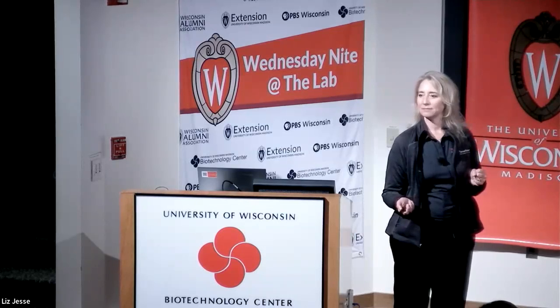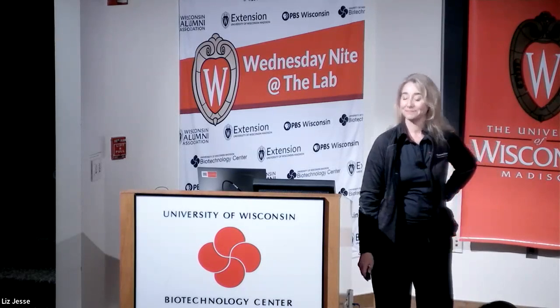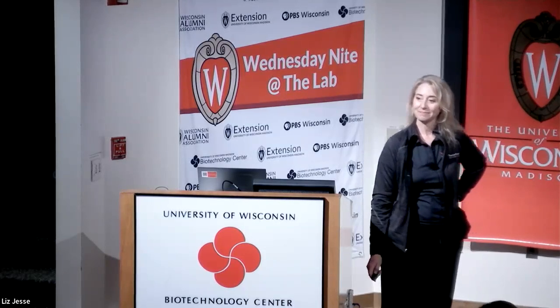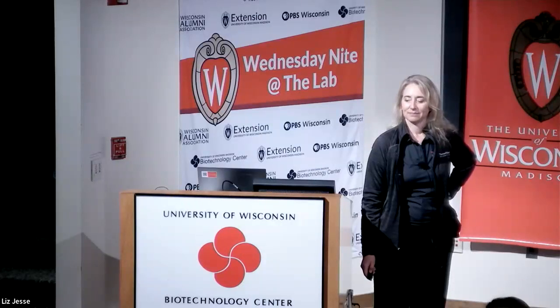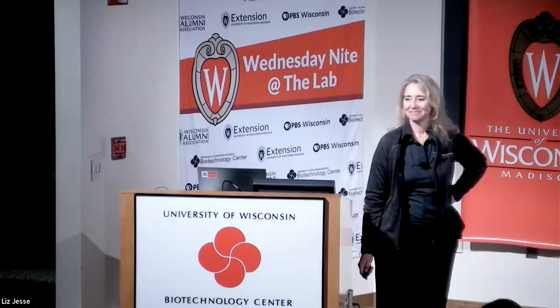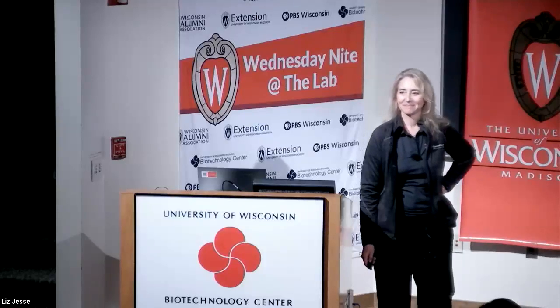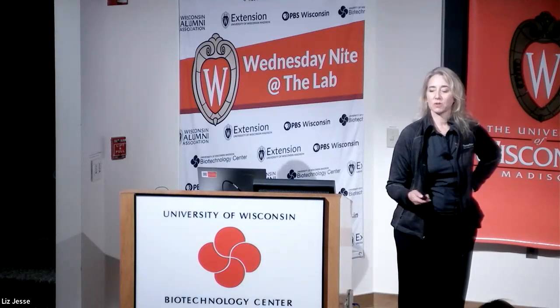If you run a relatively low expression, it seems like it wouldn't be appropriate for this sort of platform, because if you diluted your sample enough, the internal control is right. So do you feel like you'll need an internal control? That is correct. So the question is being asked about those that have used an internal control or an endogenous control in comparison to your gene of interest.